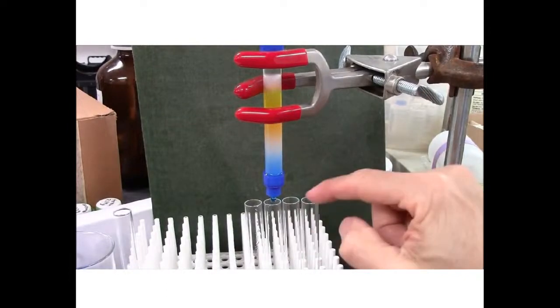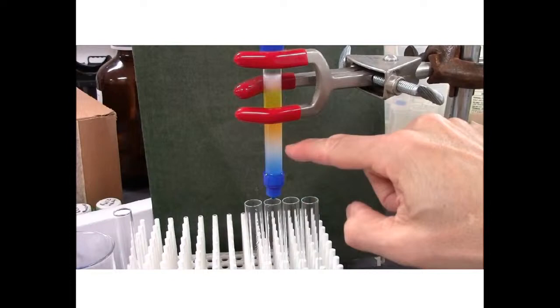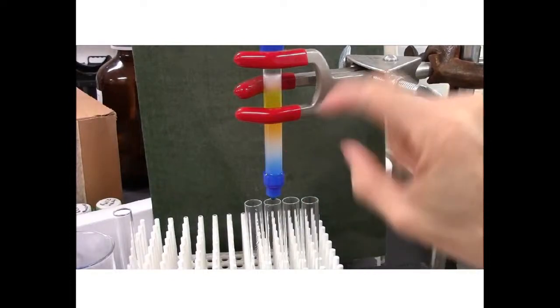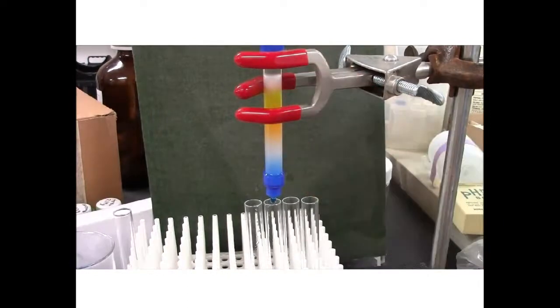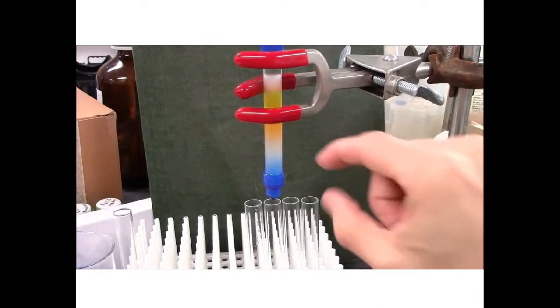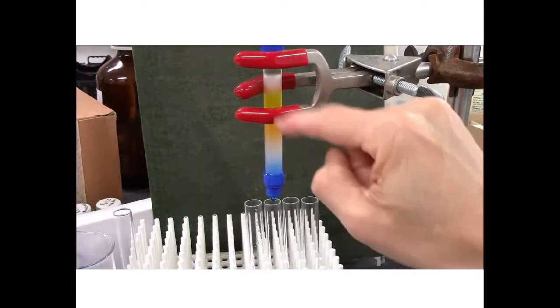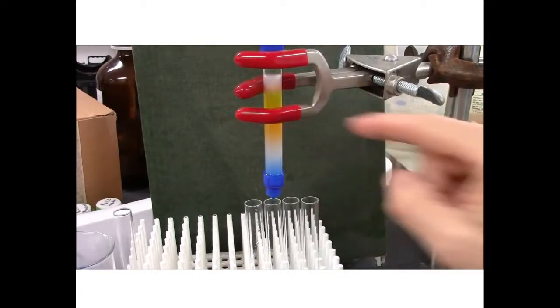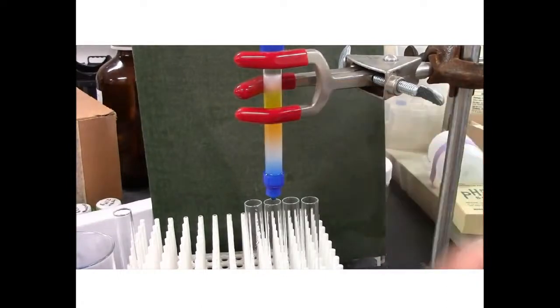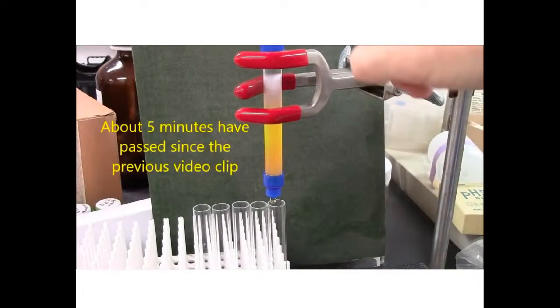So out of the bottom now, blue liquid is dripping. You can see I do have a colorless layer starting to develop here. The fluorescein has been slowed down by the gel filtration. The blue dextran is coming through. So this technique is often used to separate a protein, which is large, from the small molecules that could be salts or could be a fluorescent tag that is unwanted. I've topped up with buffer on the top so that it never runs dry.